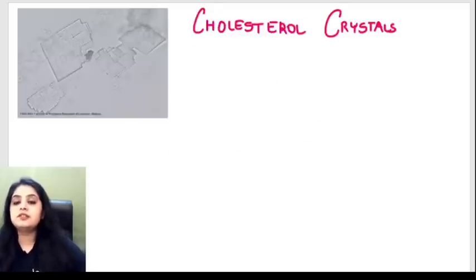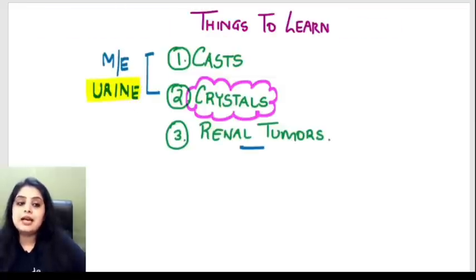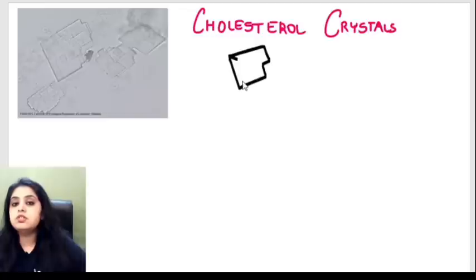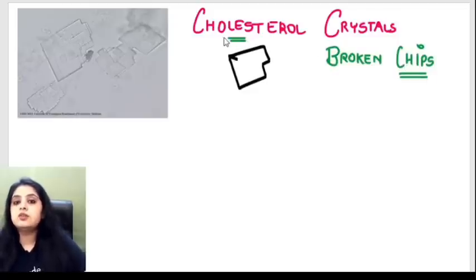The first crystal is the cholesterol crystal. These are totally unstained preparations from a urine sample viewed under a microscope. How do I identify a cholesterol crystal? It always looks like a broken chip — that's the classical description. Chips are obviously unhealthy and very rich in cholesterol, so broken chips equals cholesterol crystals. You can see those broken, notched ends in every crystal.